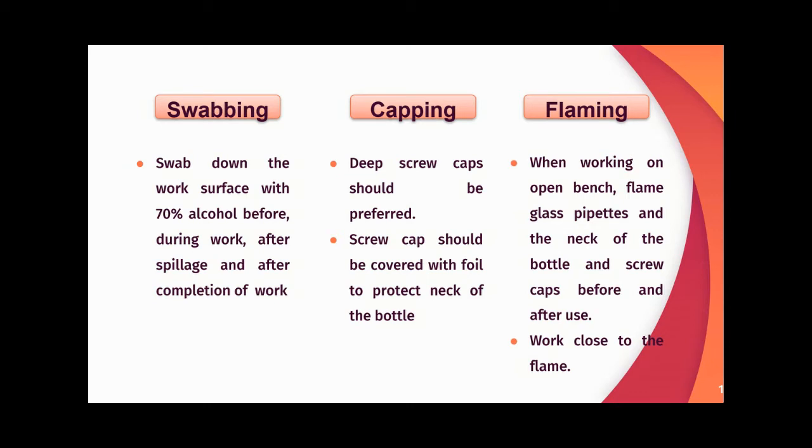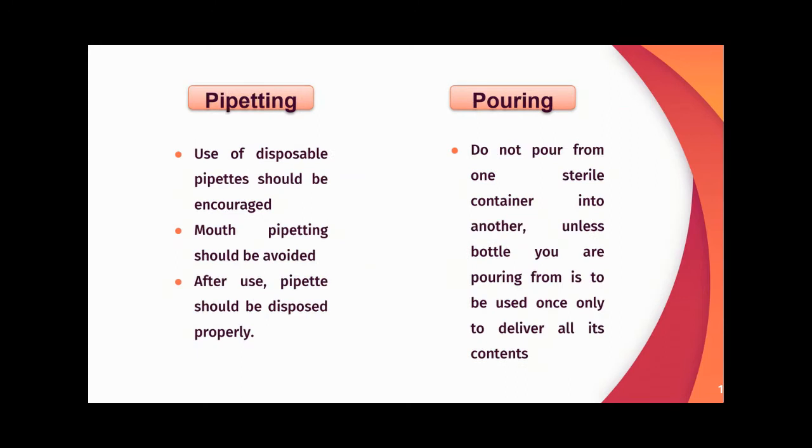For flaming, when working on the open bench, flame glass pipettes and the neck of the bottle and screw cap before and after use. Work close to the flame. For pipetting, use of disposable pipettes should be encouraged. Mouth pipetting should be avoided. After use, pipettes should be disposed of properly.